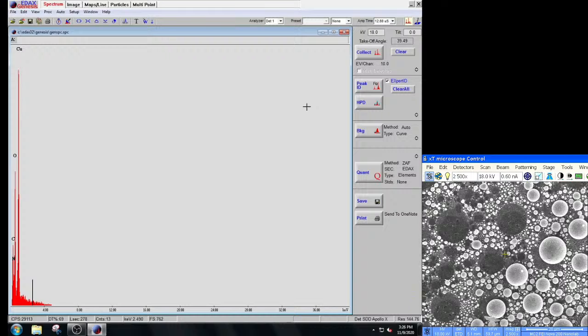Okay, that looks good. So just keep that in mind, especially with the Genesis software. If you start up that program and anything at all looks weird, best practice would be to restart the Nova server and restart both computers, because the communication chain between that computer and the Nova is always a little shaky. And you'll run into more trouble when you start to do the imaging and the mapping and stuff like that. You might be able to just do spectra, but make it easy on yourself.